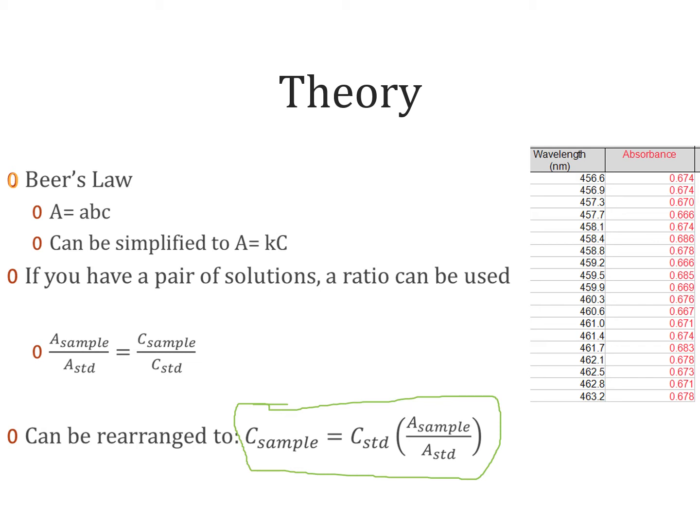And here we have the concentration of the same product that is obtained by mixing specific amounts of our reactants to obtain the standard concentration. And then we will multiply that by the ratio of the absorbance values for these two, the sample at equilibrium and also the sample of our standard.